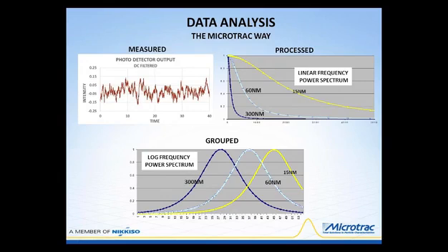That leads us to how this data is analyzed. We measure, with the system I've described, a noise-like signal that is the output of the photodetector. We get the noise signal by doing a DC filtering of the base intensity, and we're left with the noise signal. Now that noise signal has a content in it that represents the velocity distribution of the particles. And it's from that distribution that we extract the particle size.